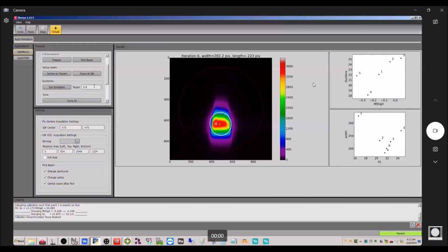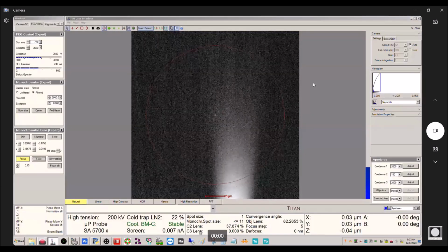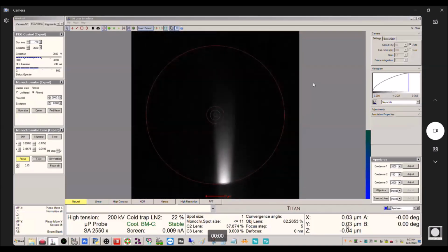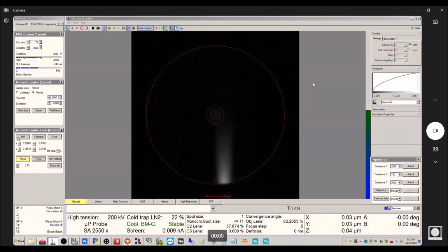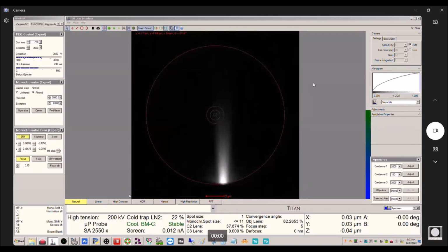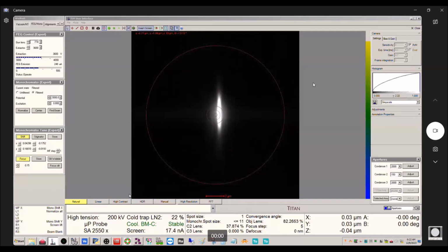We also went through setting the presets for doing the tuning, which is basically simply putting the spot size at 1, turning off the C3 lens, and backing the mag out to the lowest possible setting. Okay, that's all that means. The focusing at the slit, though, you go over this again really quickly here. As you can see, the beam had shifted from yesterday, which was fine. I knew it was going to do this. Let me spread the beam out here.